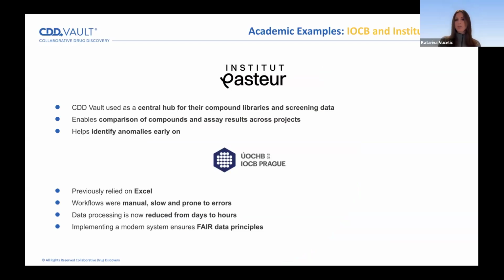Institut Pasteur uses CDD Vault as their central repository to manage their compound libraries and screening data. Given that all of their data is centralized in one location, they can manage and analyze it, compare compounds and assay results, which allows them to identify anomalies early on rather than later in the process when it's a lot more difficult, which improves their data quality but also research outcomes.